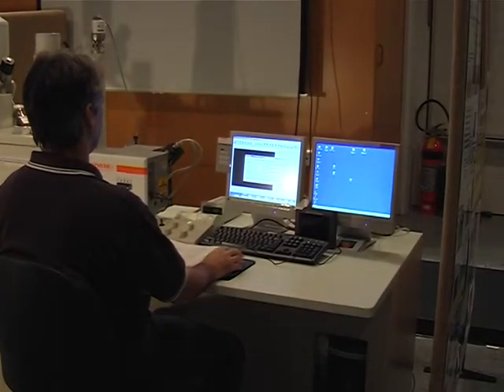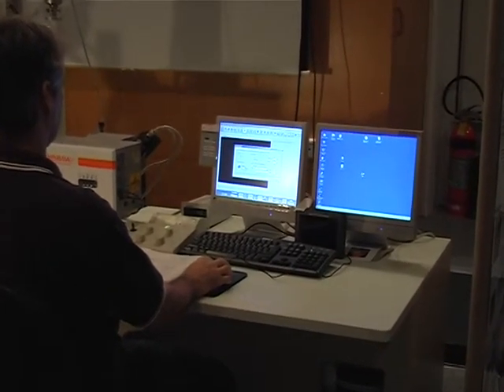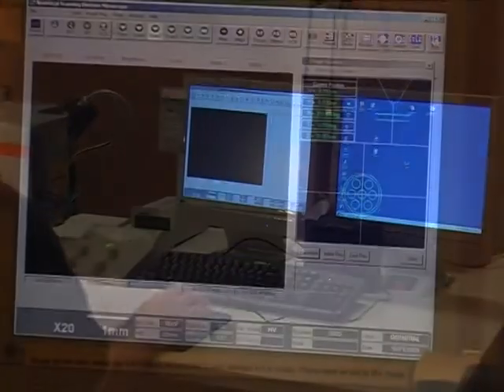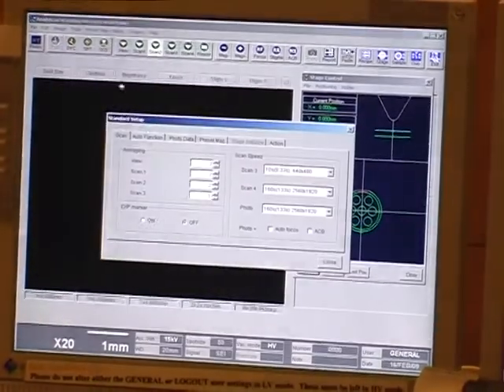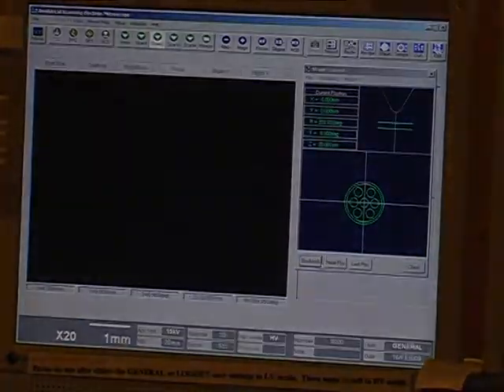Enter the height of the specimen above the rim plus 2 mm as an extra safety margin. Press close to save the value of the sample height. Make sure the correct header has been entered.